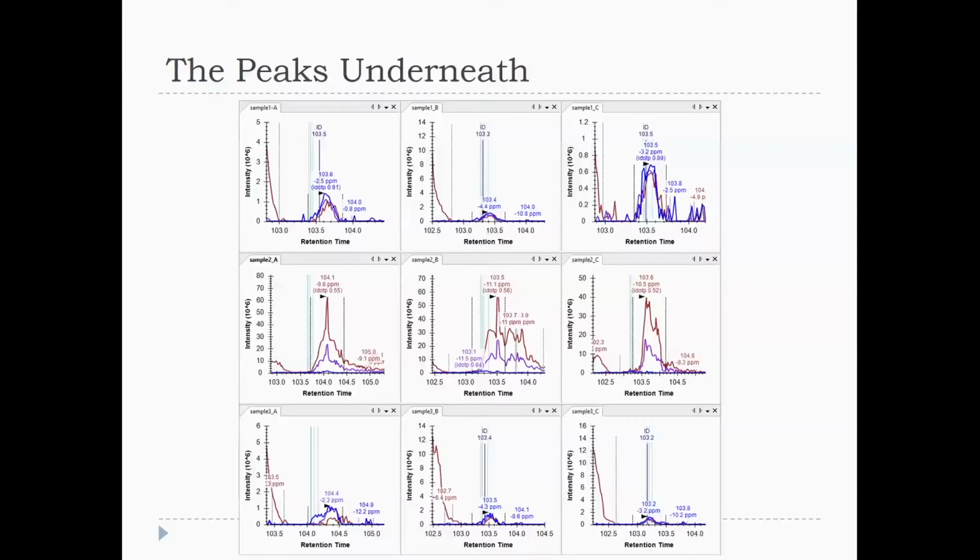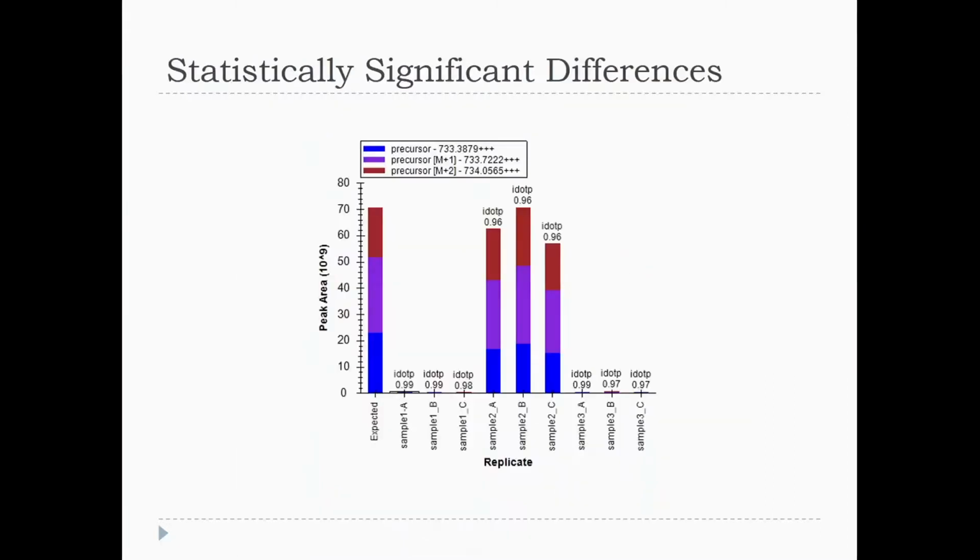Anybody else? I count 5. Where's the 6th? I get 3 here and 2 here. So it wasn't, that really is the same thing. We can tell by the alignment, but the way we're choosing this peak is based on the alignment of these ID times, and it's also the way we're choosing this peak. But here, it's really not the same thing, right? So okay, we should delete that one and forget about it.